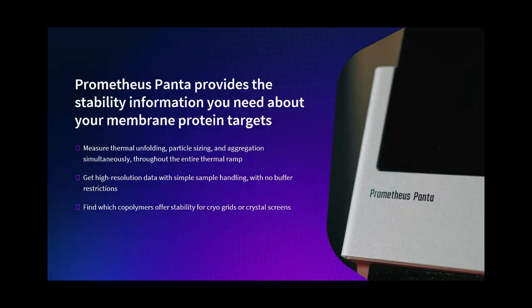Firstly, we use DLS, dynamic light scattering, to evaluate the size and the polydispersity of each complex. Is it in the range we are expecting? Is it way too large? Do we have aggregates in there? Does the PDI fit? And we really get nice PDIs with NativeMP. Often we are in the range of 0.1 to 0.3 in PDI, which is considered monodisperse. And this is great just from elution. But this is not enough.